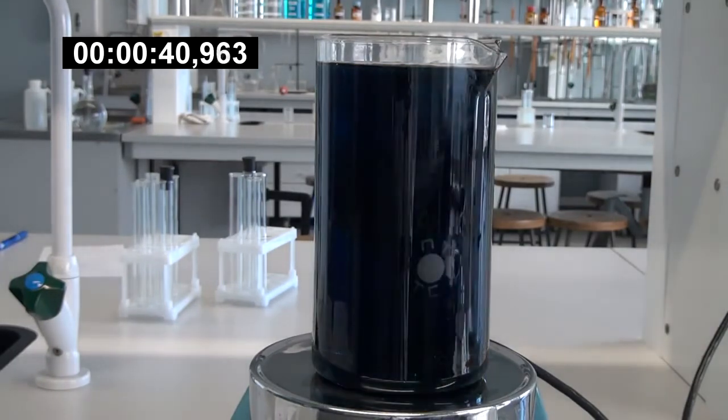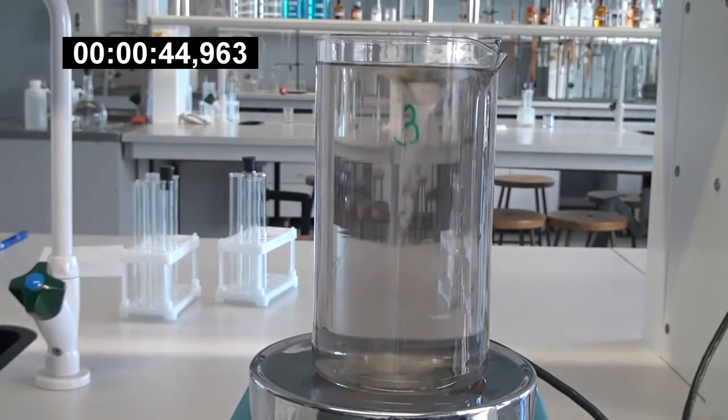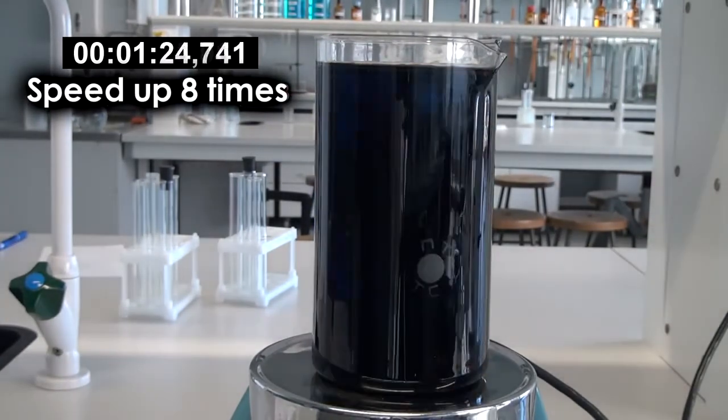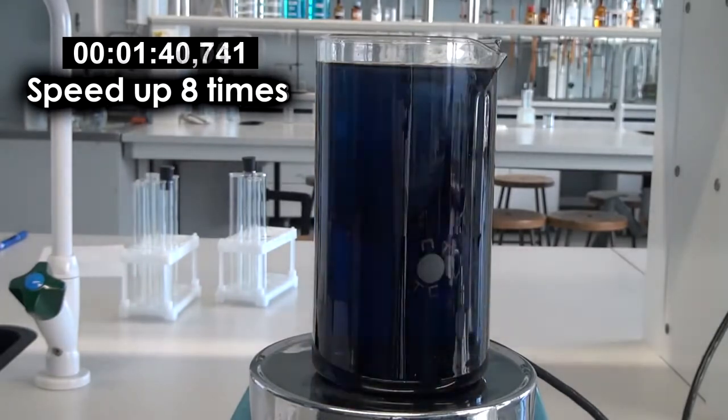Eventually, there won't be any malonic acid left in the solution. Finally, the solution becomes simply blue, as the malonic acid is consumed and can no longer restore the formed iodine.